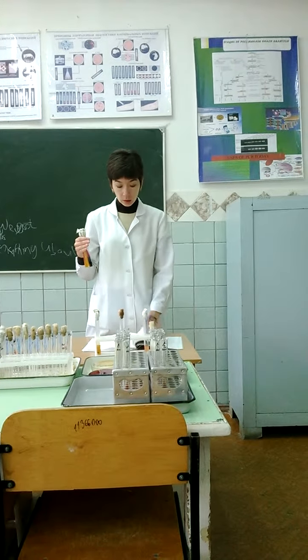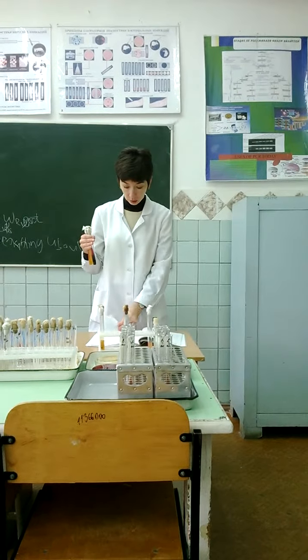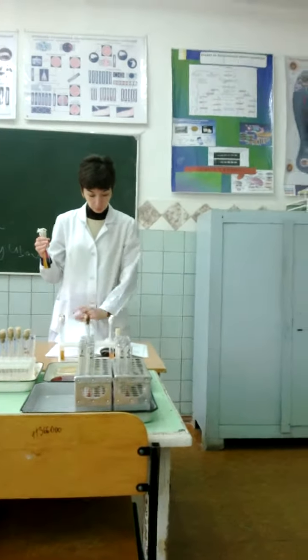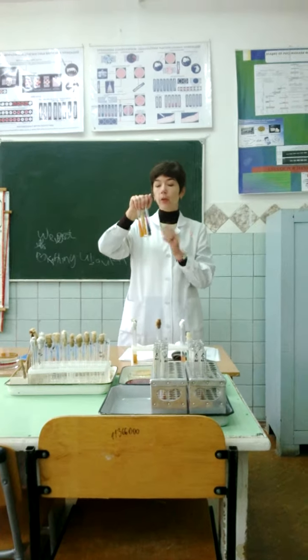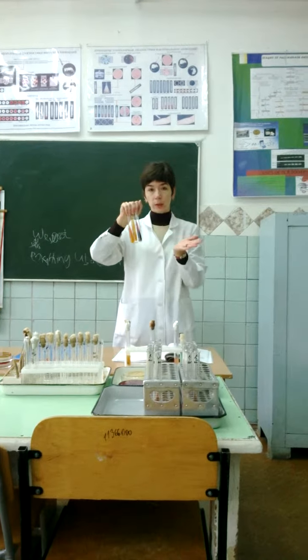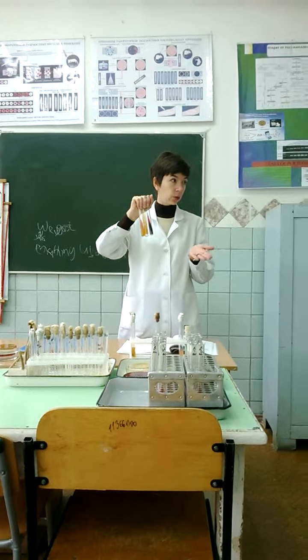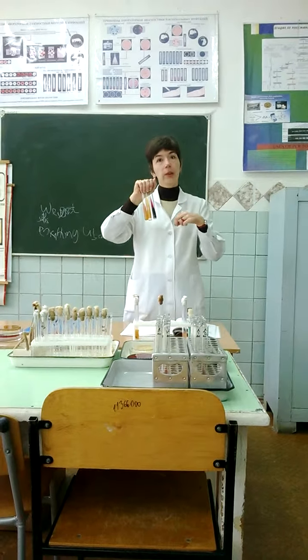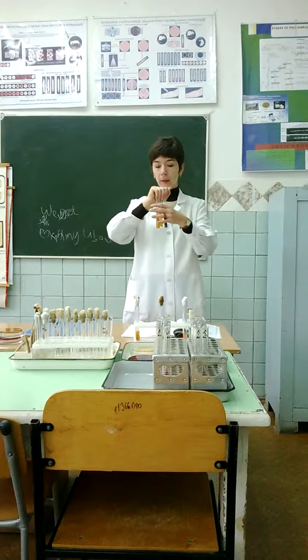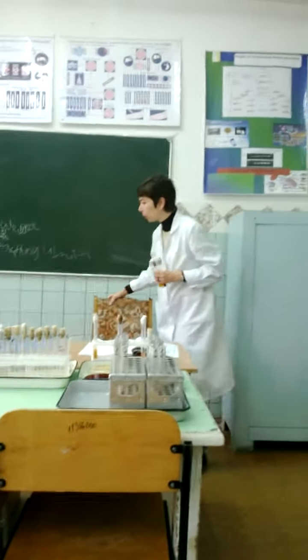In general, how does the color change? Please don't look at sucrose, because it's also negative, and for enterobacteria we don't look at sucrose. We note whether lactose and glucose are destroyed or not, by the color change.